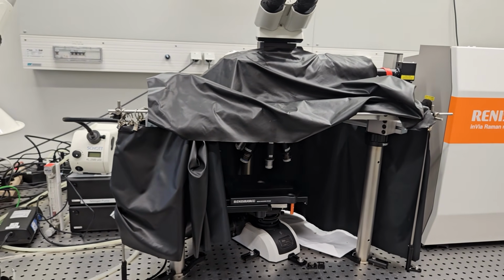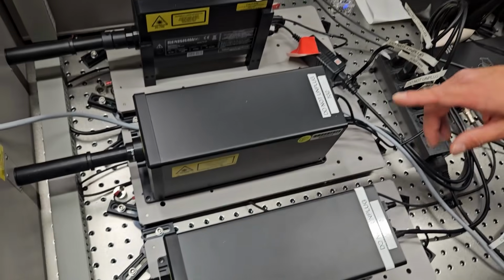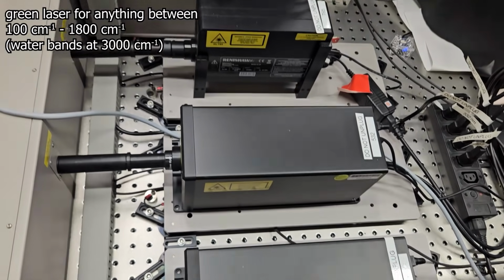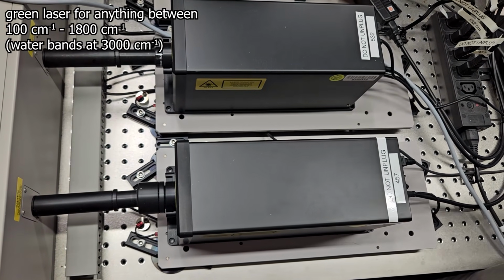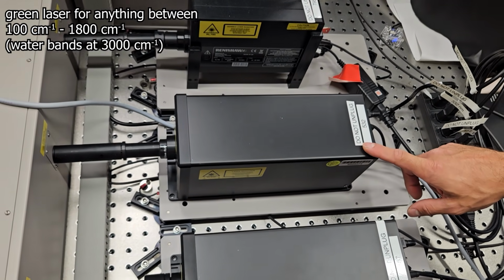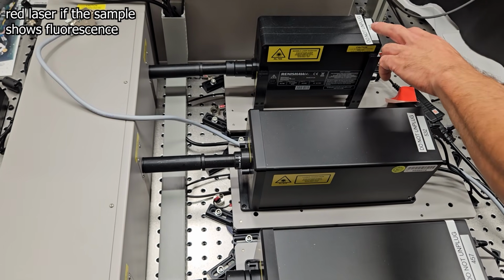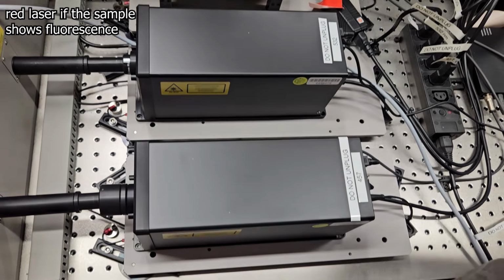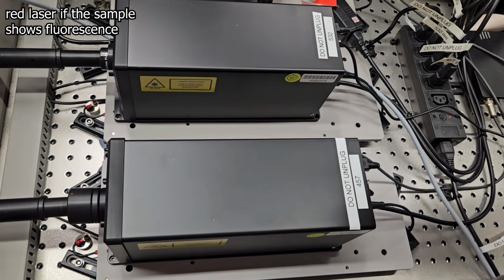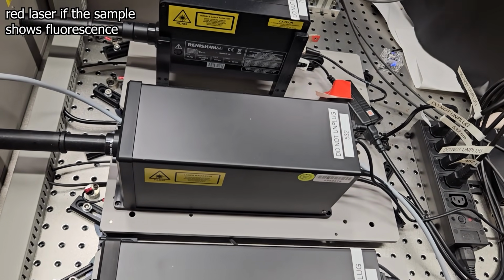Where does the light come from? Well, from these lasers. In this case, 3 different ones are built in: blue, green and red. Green is the standard because it's a good compromise of not too much energy, but it still covers a broad range that is of interest to mineralogists. The red one would be important if fluorescence occurs due to the excitation with green lasers.